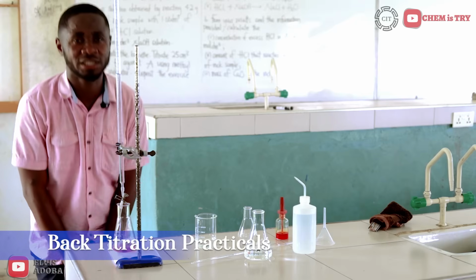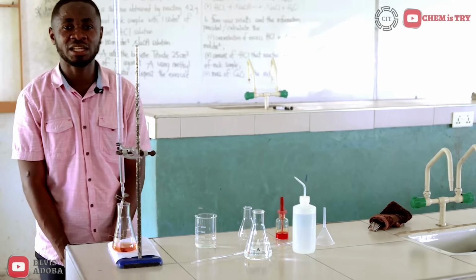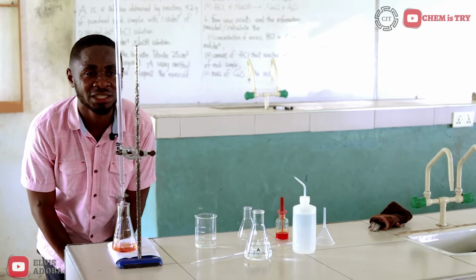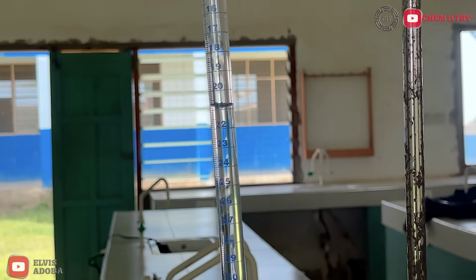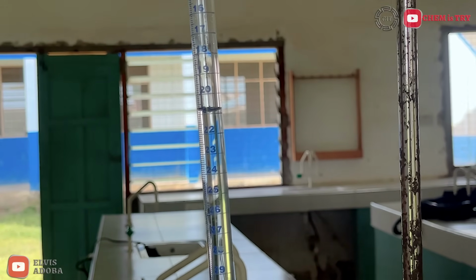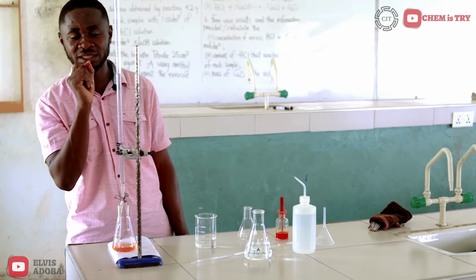20.90 centimeters cube. That's what I'm getting. The reading is taken at where the bottom of the meniscus sits. So when you look at it, you see the meniscus starts somewhere around 20.70, but its bottom sits on the 20.90 mark. That is my first titration. My initial was 0.00, and my final is 20.90.